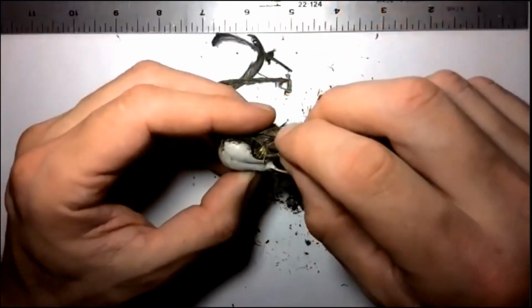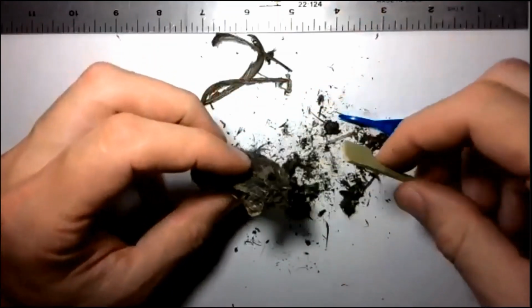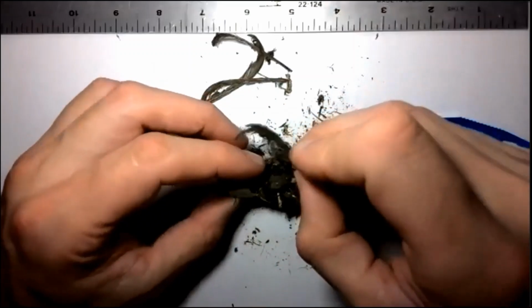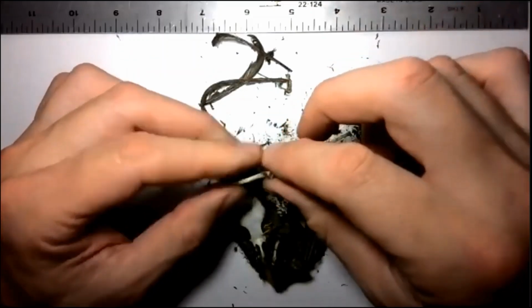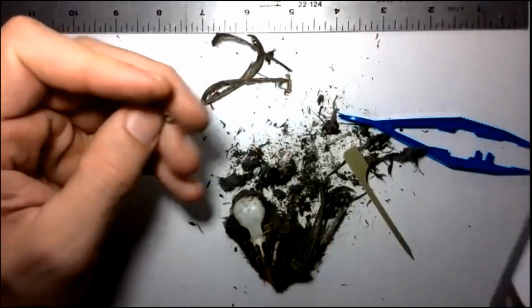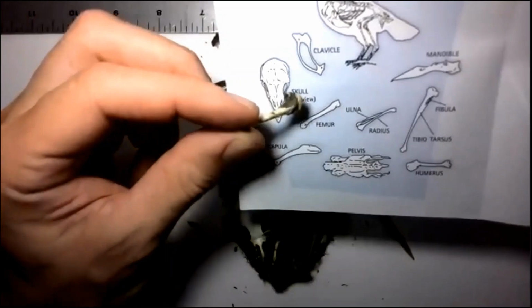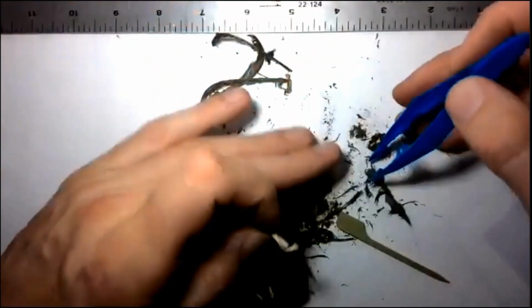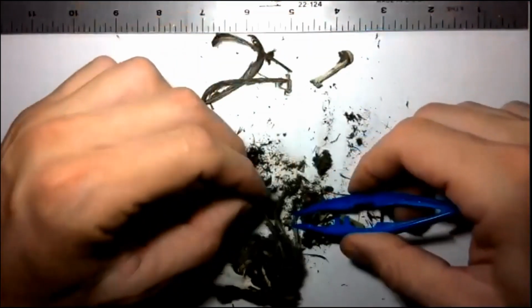More feathers keep coming, and something really, really stuck here. All right. And this, by the way, is a good sized bird. Okay. This definitely looks like a femur to me, a leg bone. Let me show you here. There, that's what I'm thinking about. Femur is the leg bone. So I'm going to start doing this in an organized way. Okay, try to separate more.